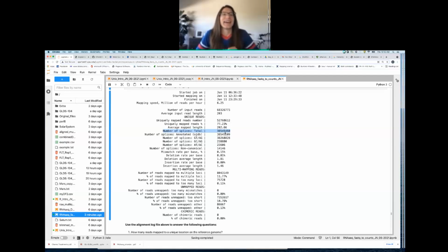No problem. But you're getting ahead, because the next question I have for you guys is, how many of those splice regions were annotated and how many of those splice regions were non-canonical? Yeah, Diksha, that's right. Now it's the right number, Hanley. Yeah, Evelyn, right. It tells you explicitly the number of splice sites that are annotated right there. So again, the majority of the splice sites that were identified were annotated. And then it breaks down those total number of splice sites.